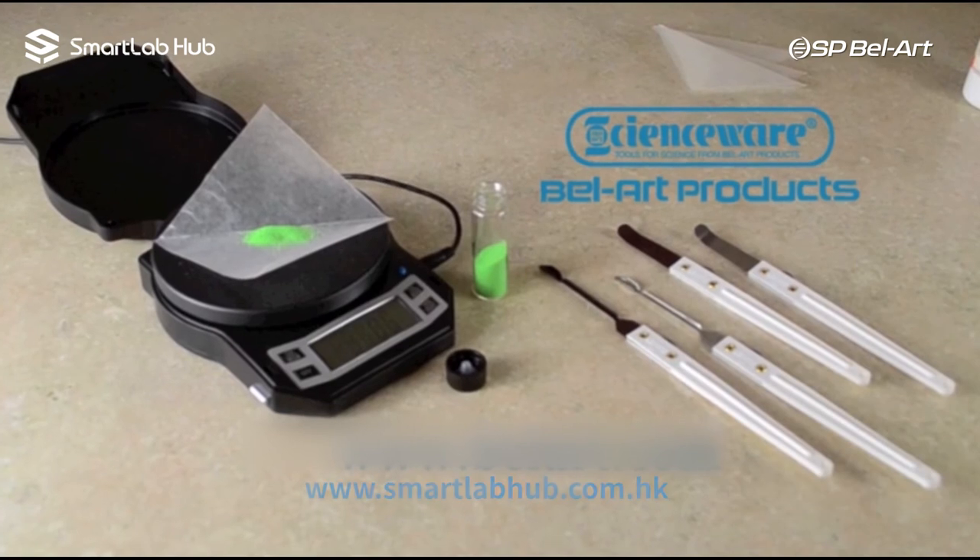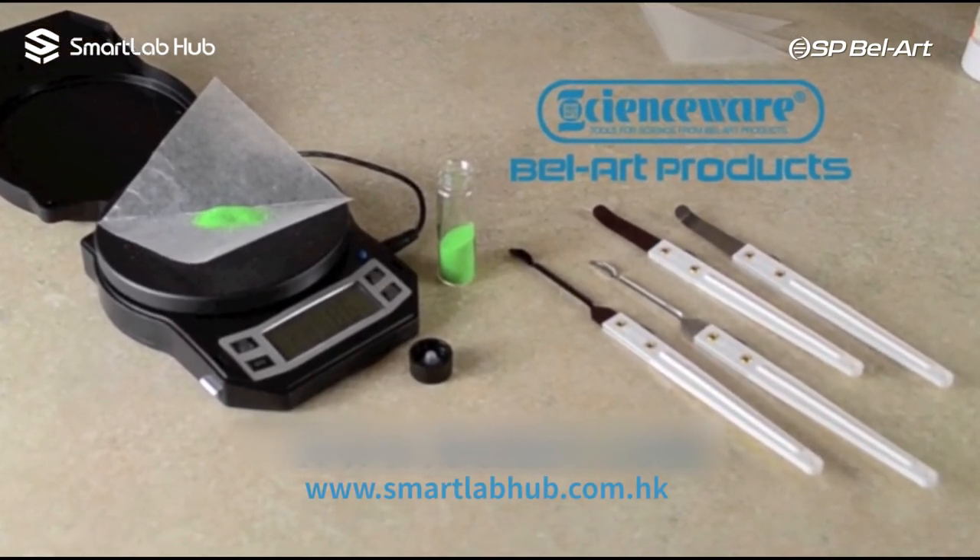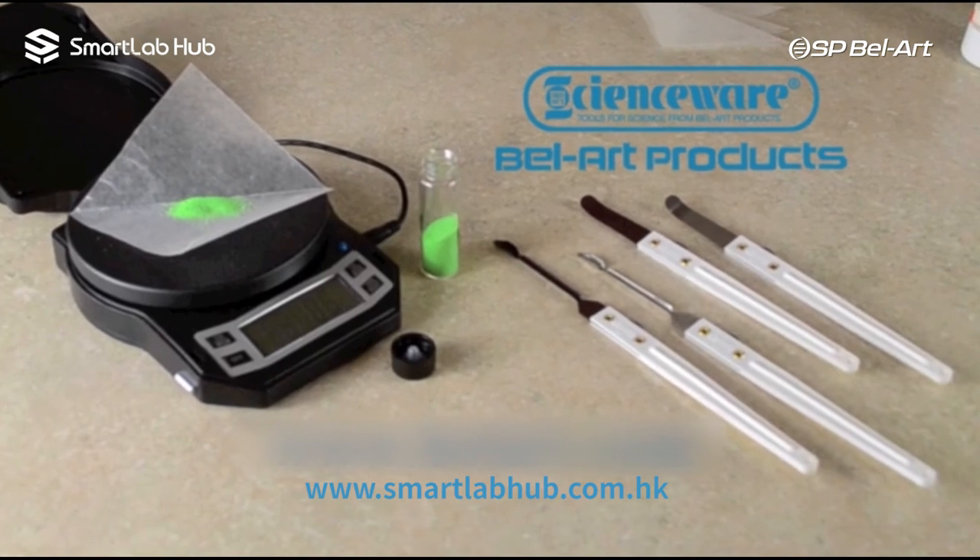Quaver and Quaverette vibrating spatulas give you more control when weighing. For more information, contact your Bellart Products distributor.